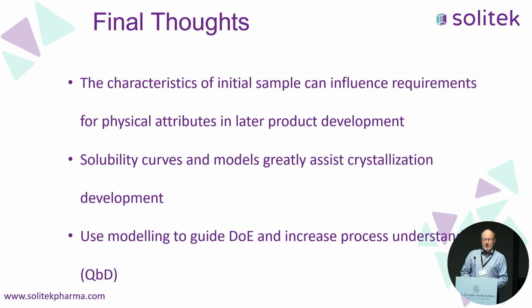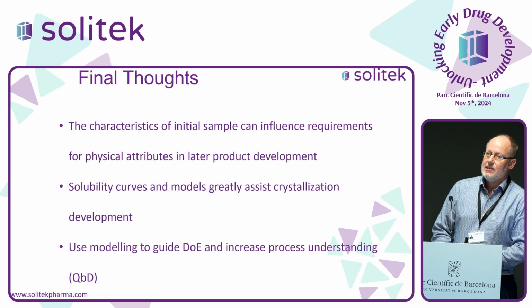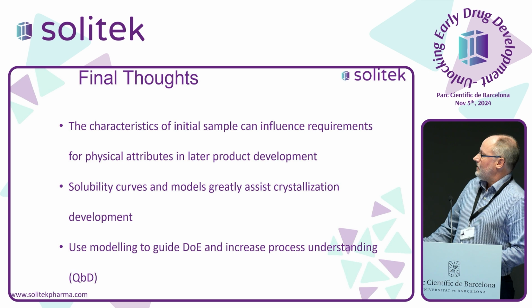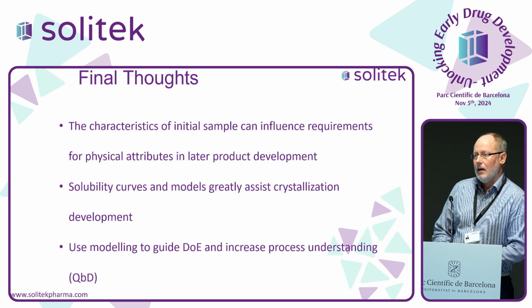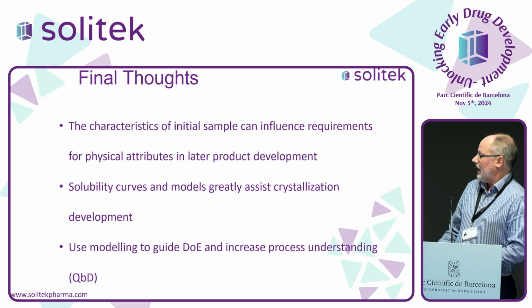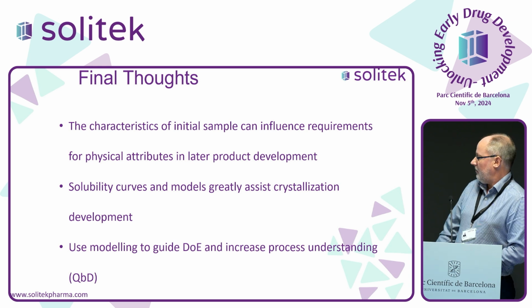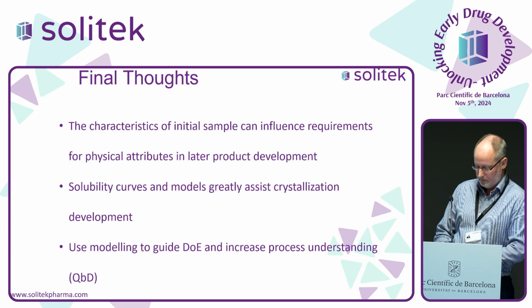So some final summarizing thoughts. Please remember that that initial sample that you provide to the formulation scientist could be critical for future process development and could set the benchmark. Solubility curves and models are essential, I would say, for any crystallization process development. And consider using modeling in conjunction with an experimental DOE to give you your full process understanding.